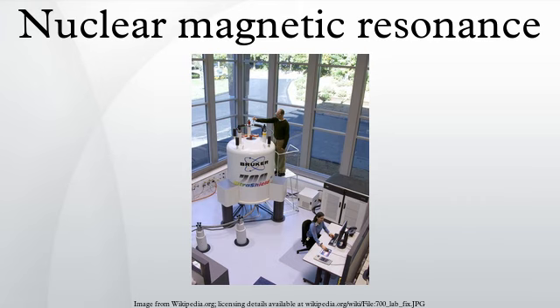It is used mainly in studies of endohedral fullerenes, where its chemical inertness is beneficial to ascertaining the structure of the entrapping fullerene. 11B, more sensitive than 10B, yields sharper signals. Quartz tubes must be used as borosilicate glass interferes with measurement. 13C, spin 1/2, is widely used, despite its relative paucity in naturally occurring carbon. It is stable to nuclear decay.